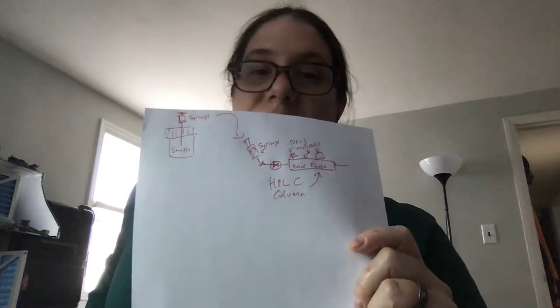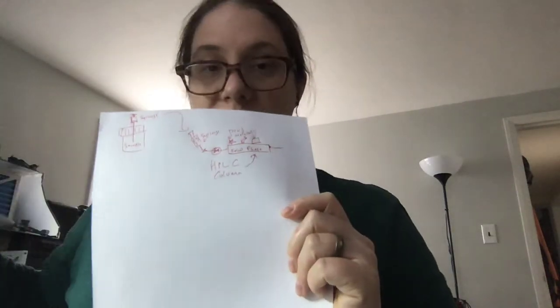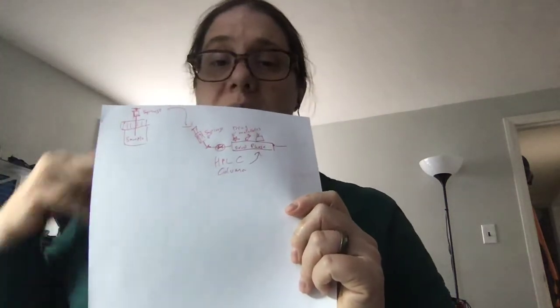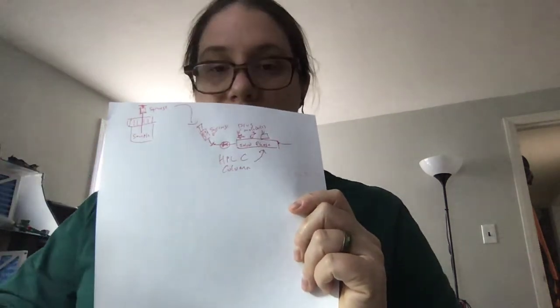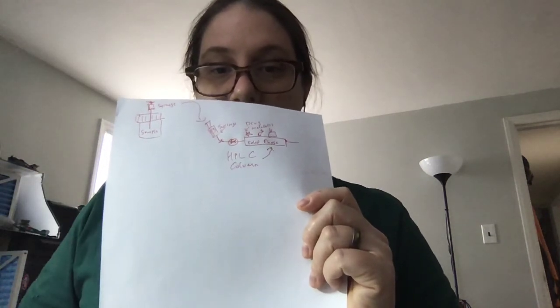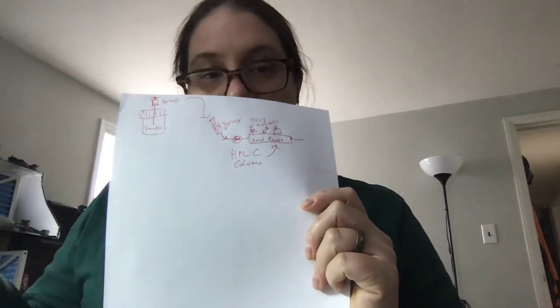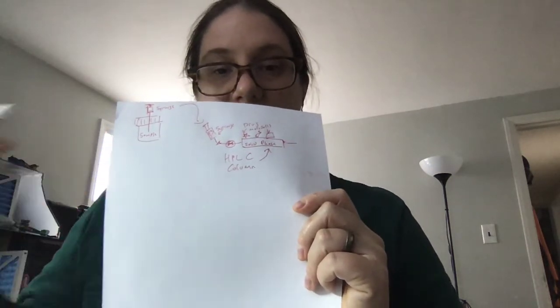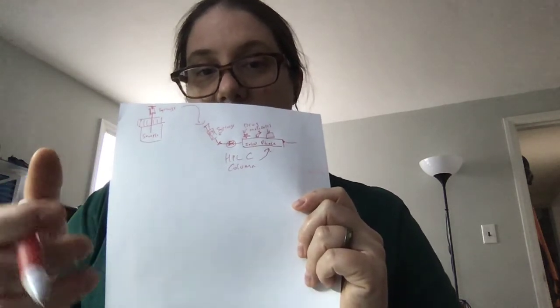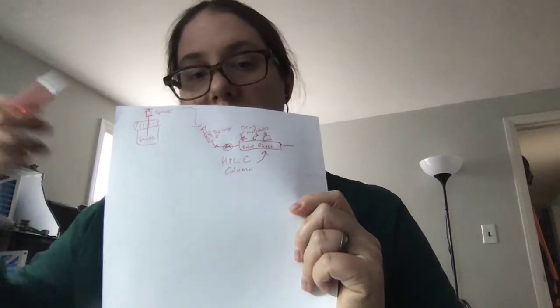As I pass more solvent over the solid phase after I've set up that initial interaction, each of these molecules from my initial metabolite sample is going to dissolve back into the solvent at a different time. So I syringe the sample into the instrument, then I'm going to pump solvent through.